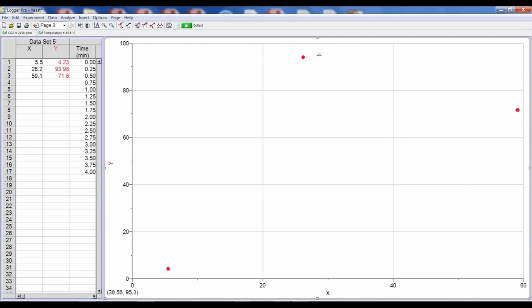Now you can do further applications of this, changing the type of manipulation or doing more statistical analysis, but this is not the subject of this video, and that's pretty much it. We have measured the rate of fermentation in cold, warm, and hot water. We have observed that rate of fermentation has some optimum value at some warm temperature, and it declines as the environment gets cooler or hotter.